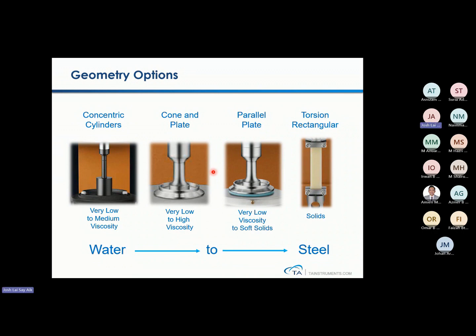Okay, like honey that can stay on this flat surface, then you may go for cone and plate and parallel plate. Of course, parallel plate and cone and plate have different sizes as well that I will explain to you later. Which one to go for?